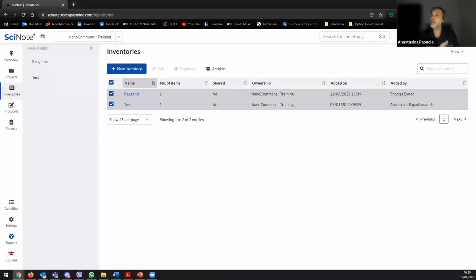and no one outside the assigned people is able to access this. Okay. Theoretically, the philosophy is that if you are part of a team, then you should know that you are part of the team, in which case people are able to see the other people that are within their team.